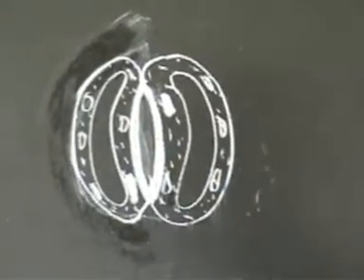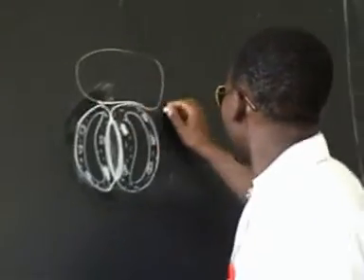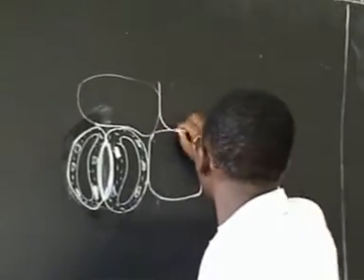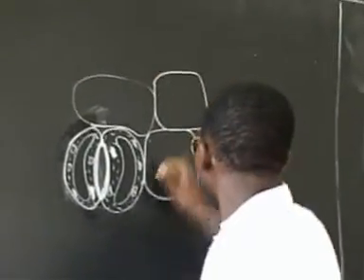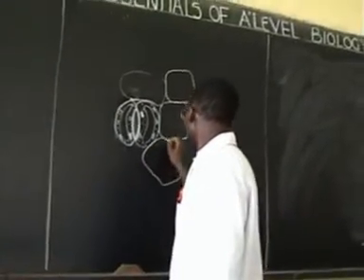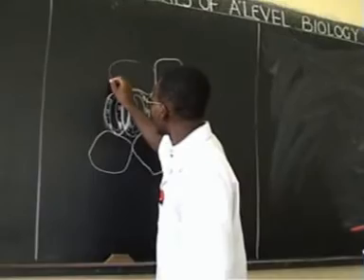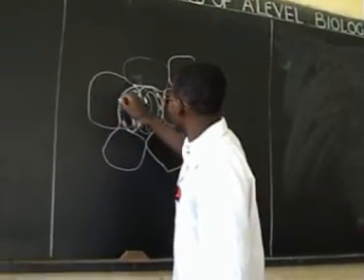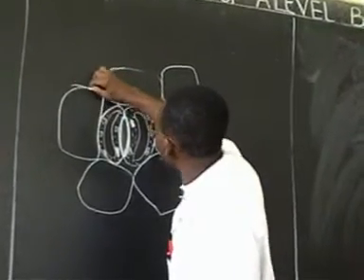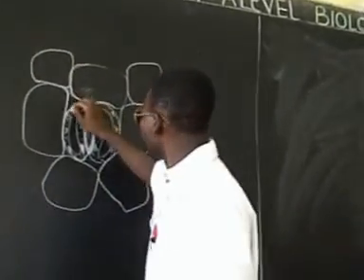So I put the dots on the cytoplasm, and then there were other cells. There was a group of other cells like that, and you notice that some are like squares, some are like pentagons. Some have 5 sides like that. The cells were as such.